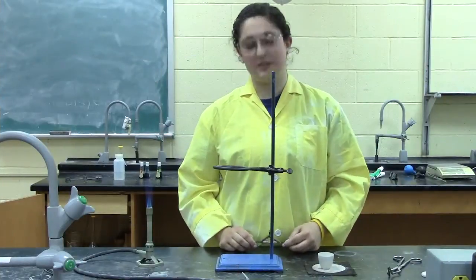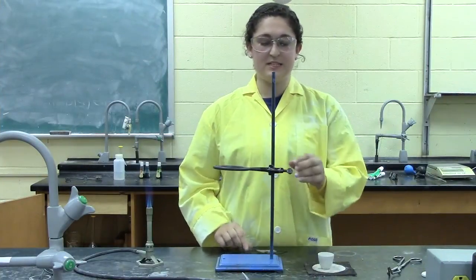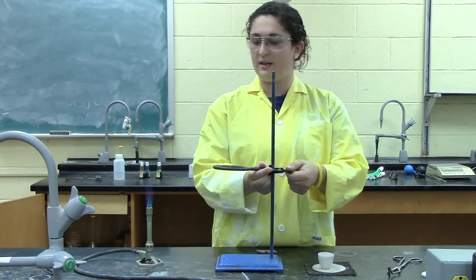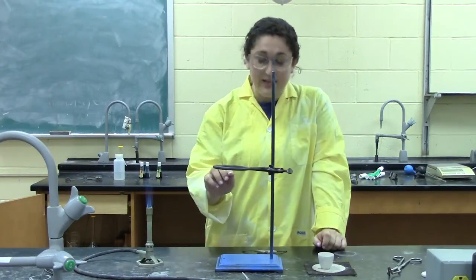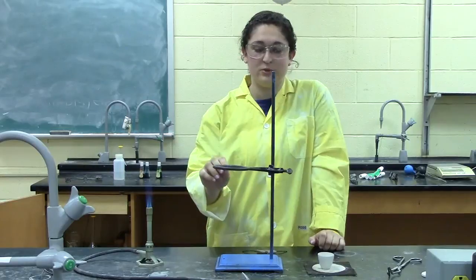When using a Bunsen burner to dry a sample, you first need to attach your iron ring to your stand. It needs to be at a height where the inner core is at a good height to heat your sample because you want to heat the crucible intensely.